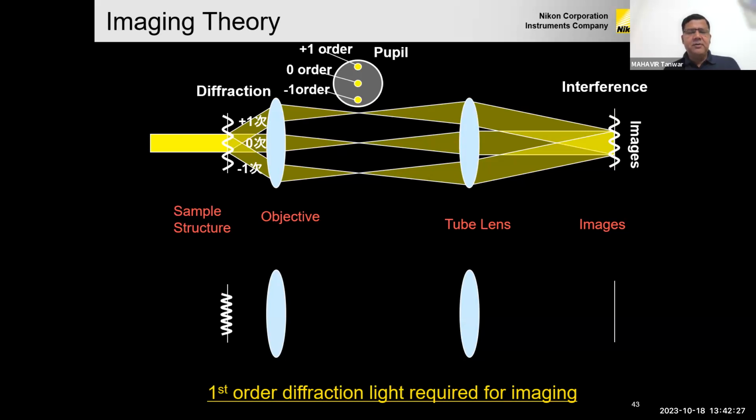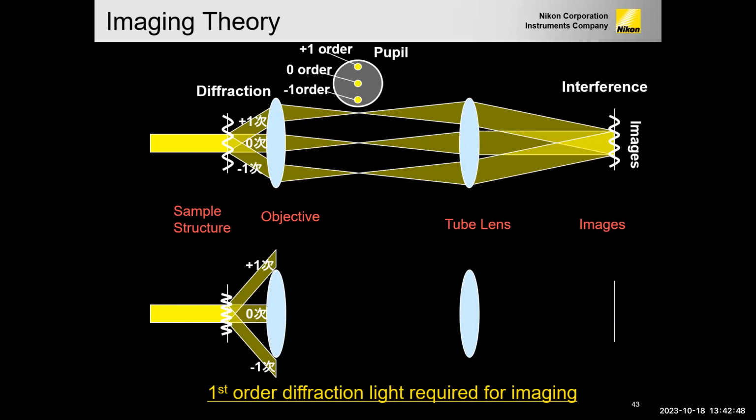But let's say we talk about a very high frequency, a sample which has a very high resolution capability, wherein you can get a very highly resolvable image. This is a high frequency. This is how it is going on. Is this clear, sir? Now it is better. Yes. That's why you need an even higher NA, but that is not possible. Not possible. So virtually, I'll tell you how to do that.